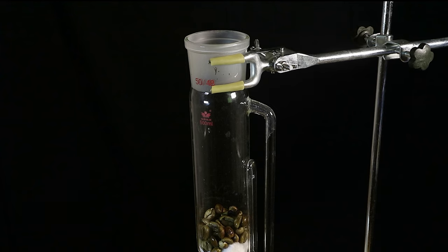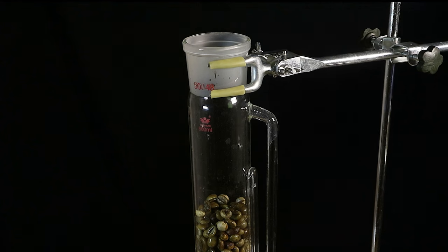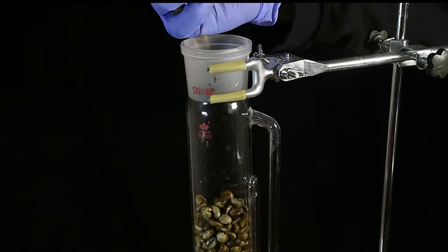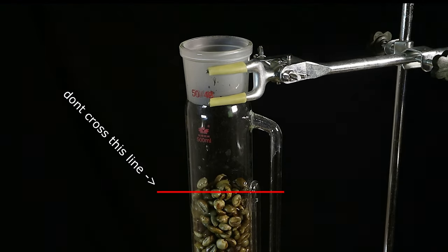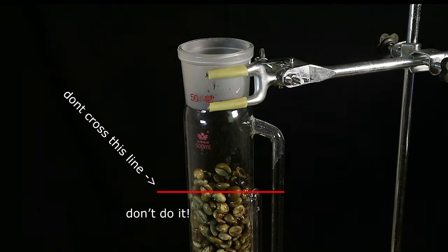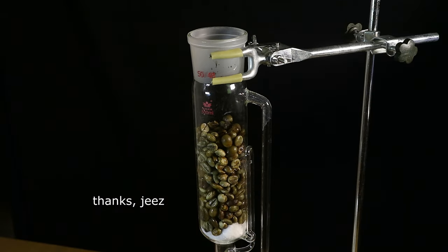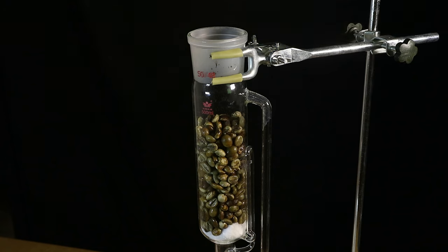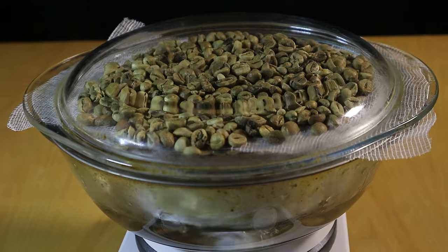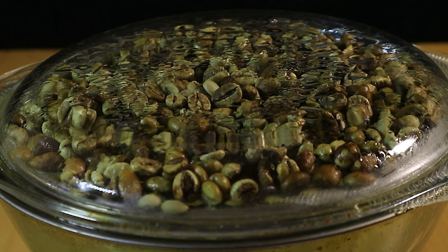Now we can start filling the extractor chamber with our steamed coffee beans. Normally we might want to increase the surface area of the source material as much as possible before extracting with a solvent, but since this is best achieved by grinding it into a powder and we want to keep the beans — wait. You have to keep the material under the level of the siphon tube. Darn it, I didn't take into consideration just how much the beans would expand when we steamed them.